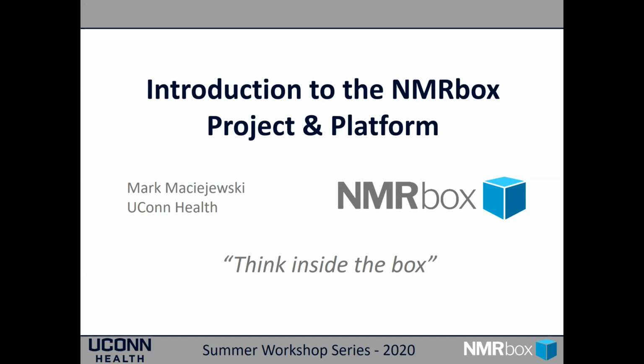So I'm going to give a quick introduction to the NMRbox project and to the platform. And I'll be disconnecting from my talk every once in a while and actually going and using NMRbox and using a website to show you some various things.